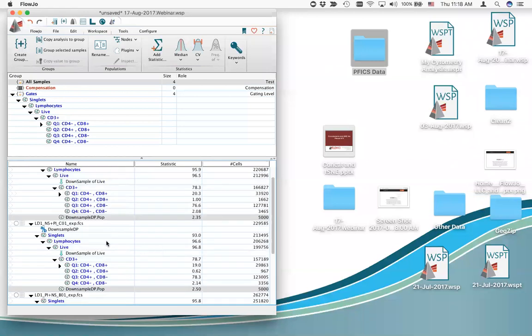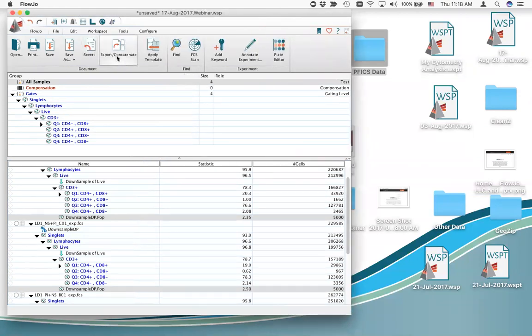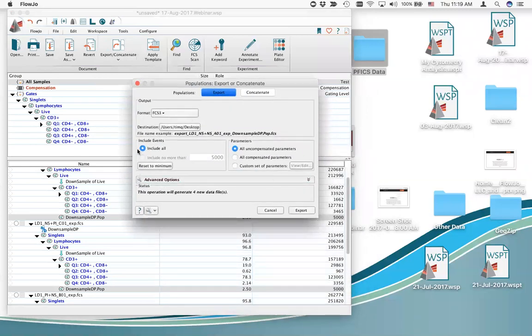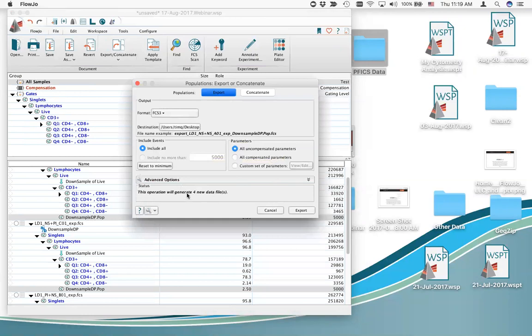Now with all four populations selected, go to the file tab and select export/concatenate. I'll select export/concatenate populations because I want only the live events from my downsample DP pop gated populations. This brings up the interface for configuring the export or concatenate save. Export is the default — notice at the bottom it says 'this operation will generate four new data files,' meaning it would export them as individual files without merging.